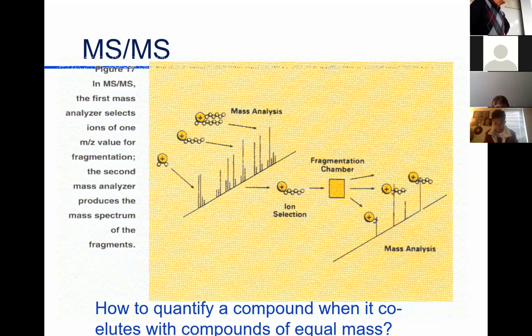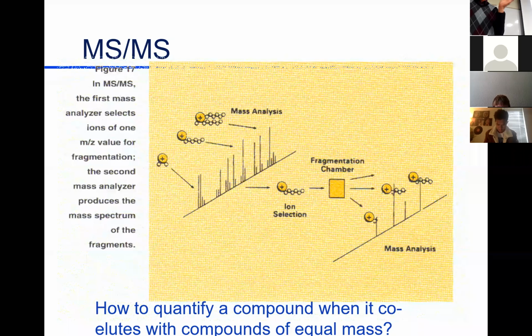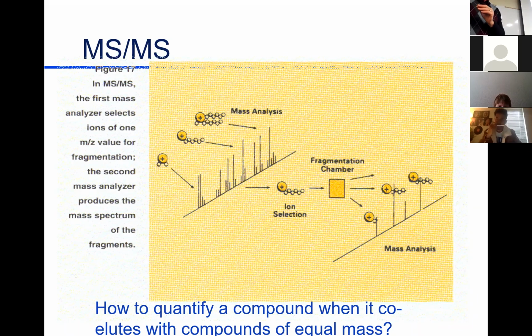We have the ability to do something that's pretty neat also. And I'm not stuttering, it's MSMS. It is MSMS, I'm sorry. It's not a mistake. What we do is we do mass spectrometry. We blow this molecule into pieces, and we get all those pieces. Oh, that's nice. But then we blow every one of those pieces into more pieces. Because if we have a fragment at, let's say, 128 mass, gosh, that could be put together from different things. How do we know what makes that 128? So let's take that fragment and blow it to bits. Oh, okay, that's what it is. So we know that the fragments are from a specific molecule. It's really ensuring, again, that you're measuring what you think you're measuring, absolutely.